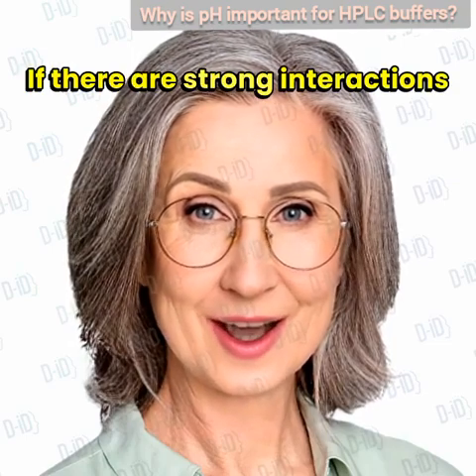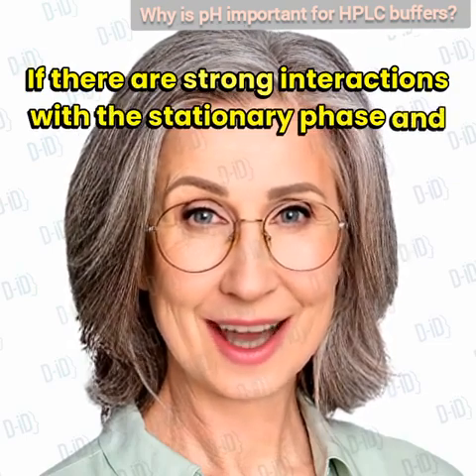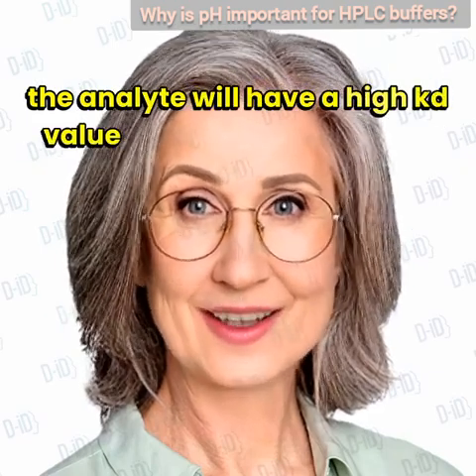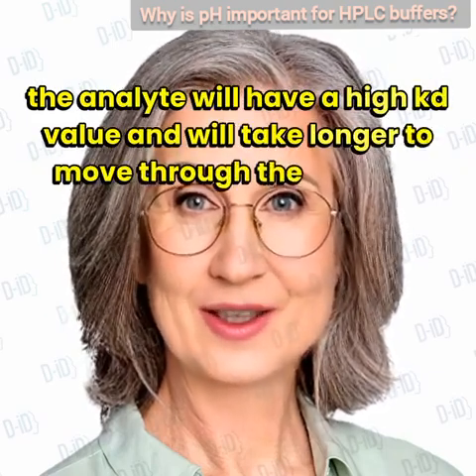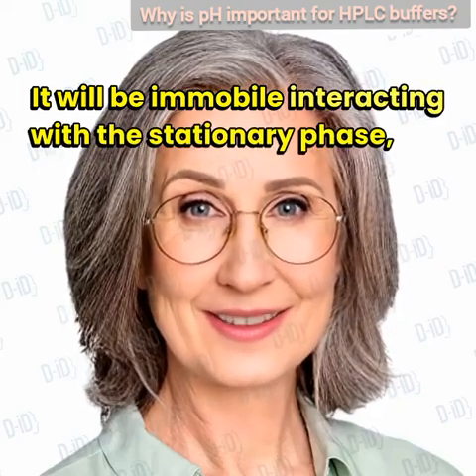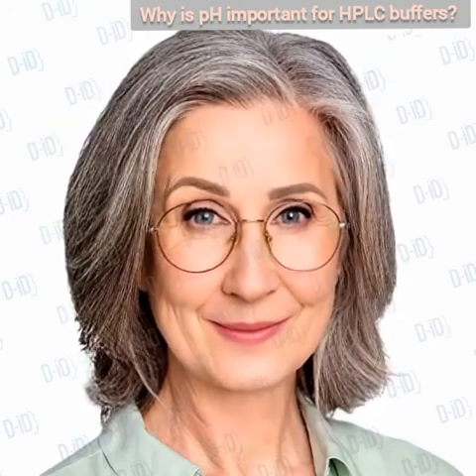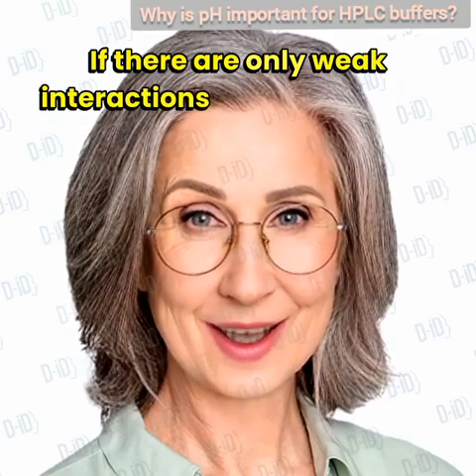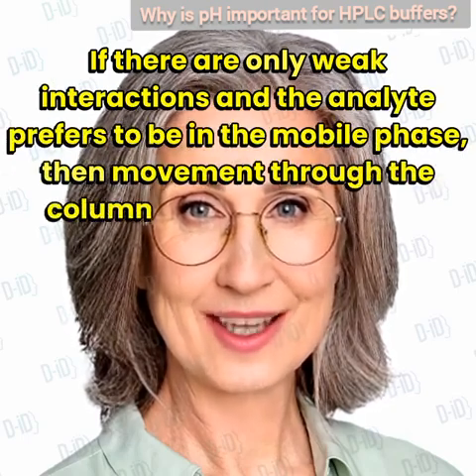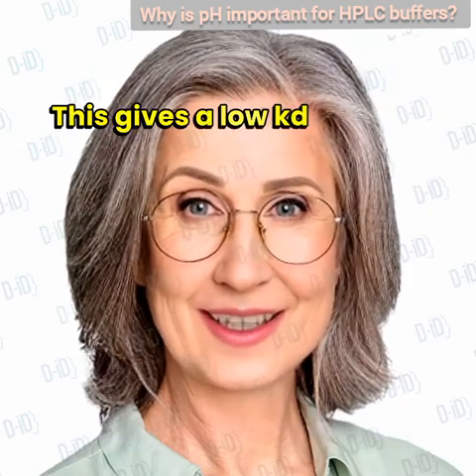If there are strong interactions with the stationary phase, and not much affinity for the mobile phase, the analyte will have a high Kd value, and will take longer to move through the column. It will be immobile, interacting with the stationary phase, not progressing through the column. If there are only weak interactions and the analyte prefers to be in the mobile phase, then movement through the column will be much faster. This gives a low Kd value.